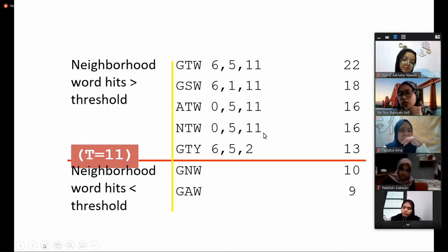You don't need to really understand how this happens. I would suggest you find a short YouTube video that tells you about the BLAST algorithm, or how word size in BLAST works. The only important bit is the threshold level, which in the default setting is normally set as 11.